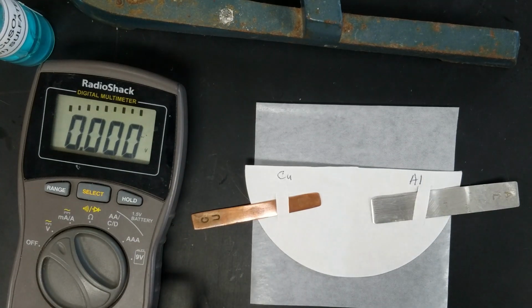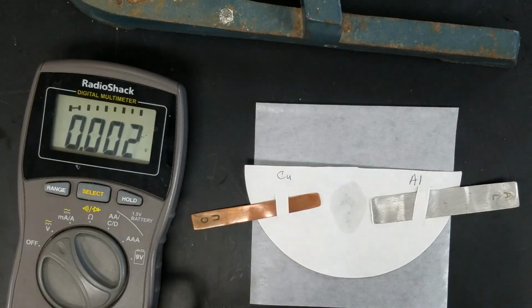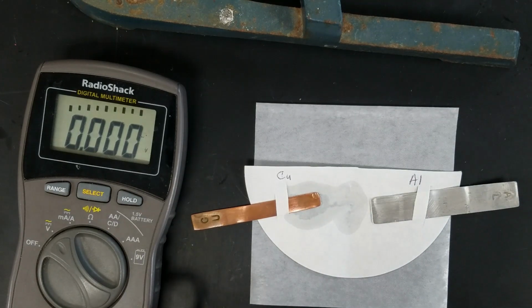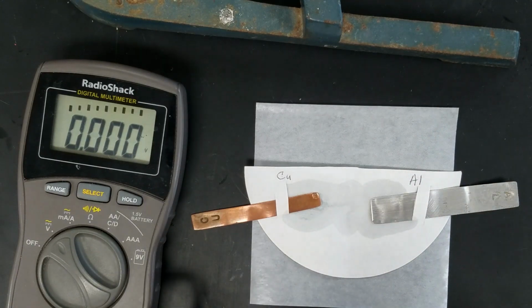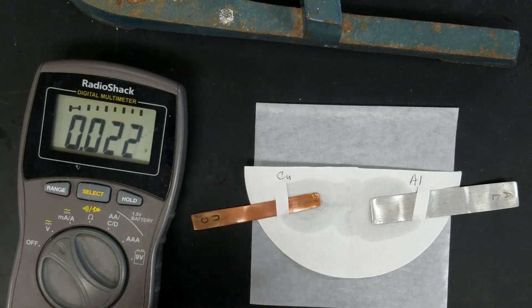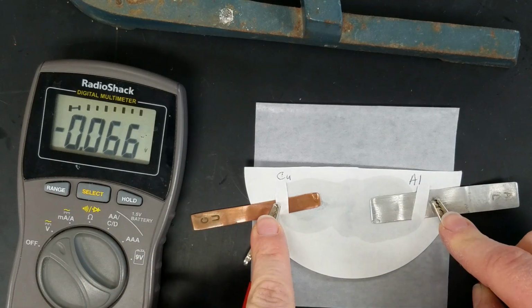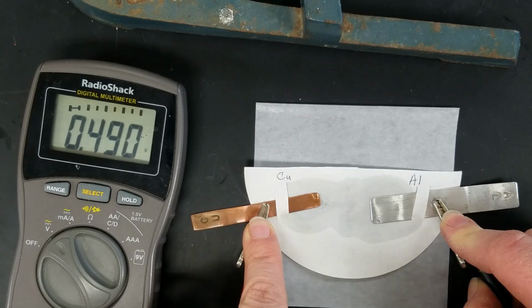We're now going to try copper versus aluminum. We add our copper solution to the copper side and aluminum solution to the aluminum side. Now when you're balancing these chemical reactions, make sure you remember what charges your metals have and that you have to balance the amount of electrons, or the amount of charge, as well as the ions. I'm going to start with red on the copper side, black on the aluminum side. And you want to record your voltage.